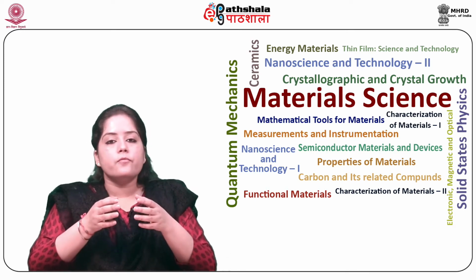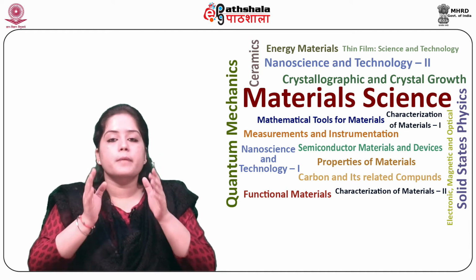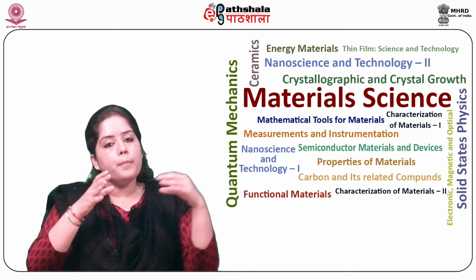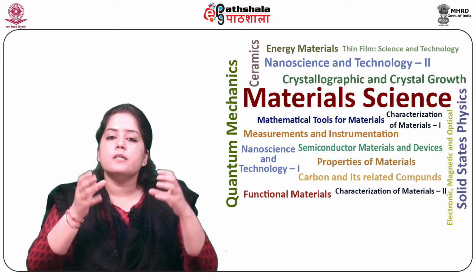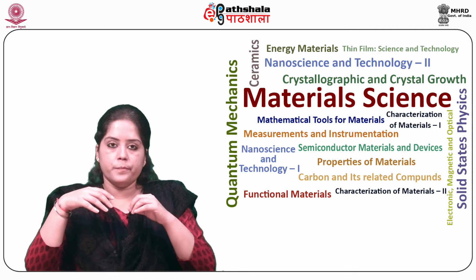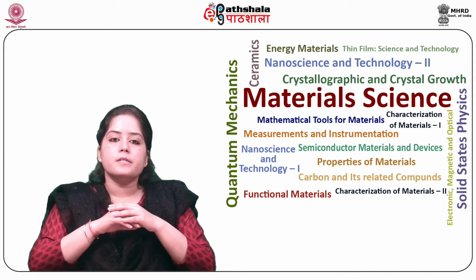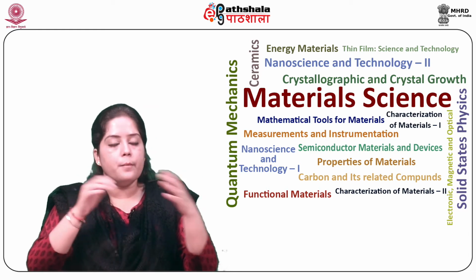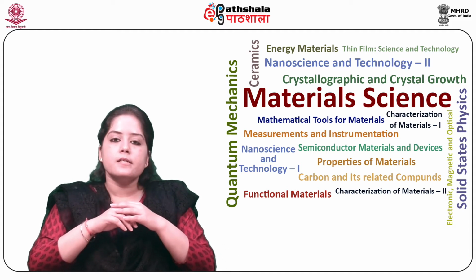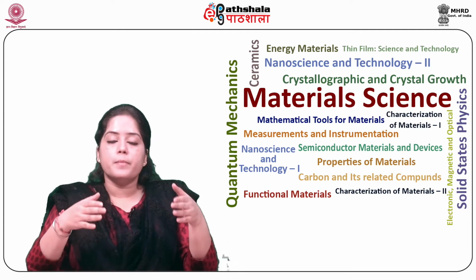FTIR stands for Fourier Transform Infrared Spectroscopy, the preferred method of infrared spectroscopy. When IR radiation is passed through a sample, some radiation is absorbed by the sample and some is passed through, or transmitted. So the resulting signal at the detector is a spectrum representing a molecular fingerprint of the sample. The usefulness of infrared spectroscopy arises because different chemical structures, molecules, produce different spectral fingerprints.